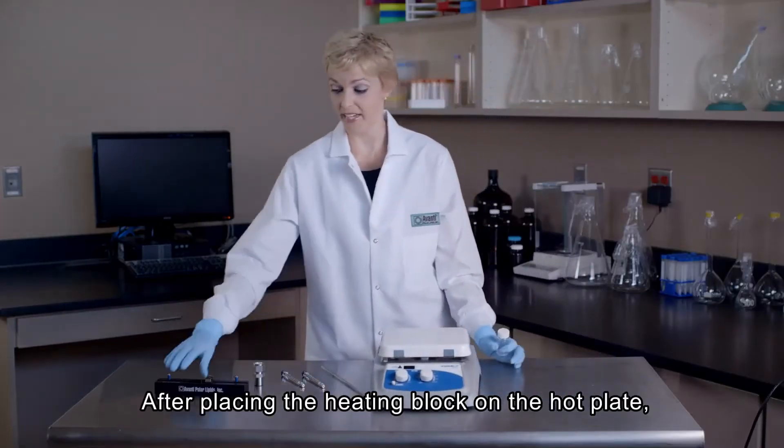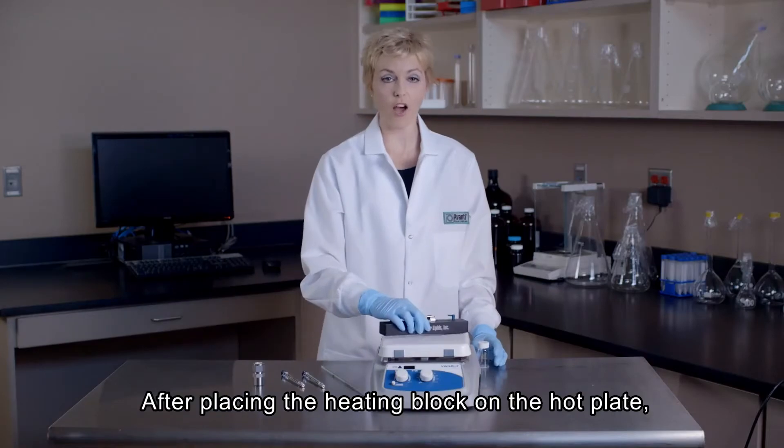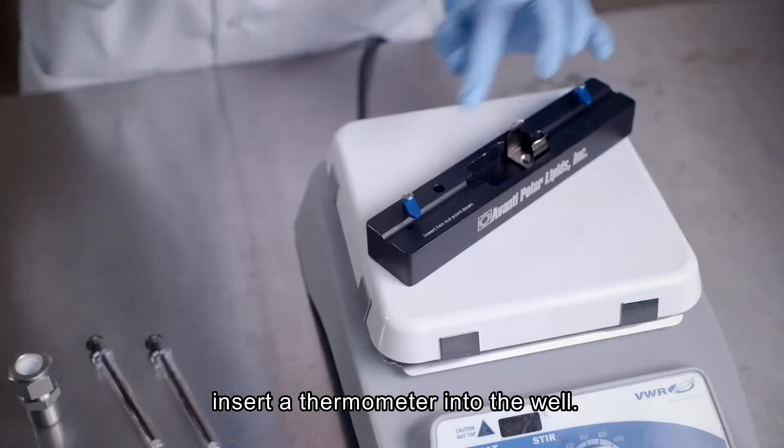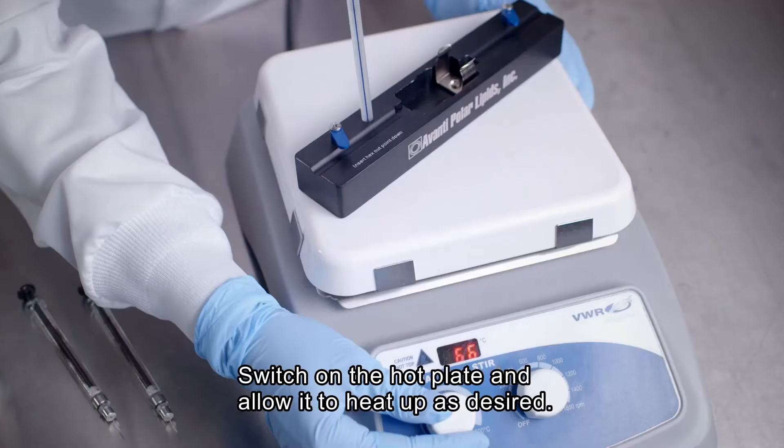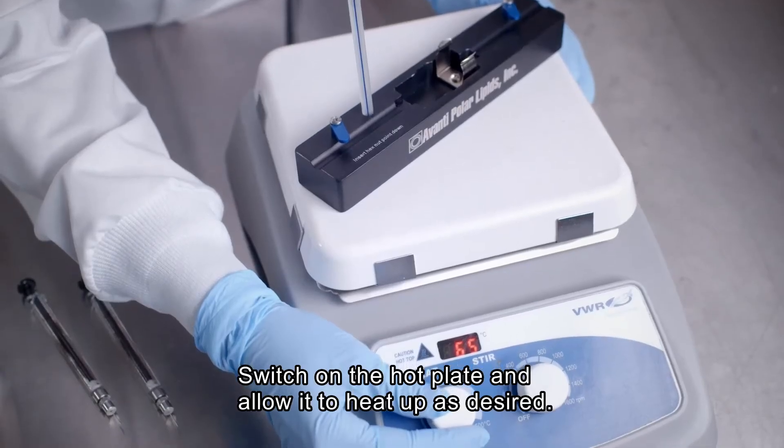Next, we will place our heating block on the hot plate, insert a thermometer into the well provided on the heating block, switch on the hot plate, and allow the hot plate and the heating block to reach the desired temperature.